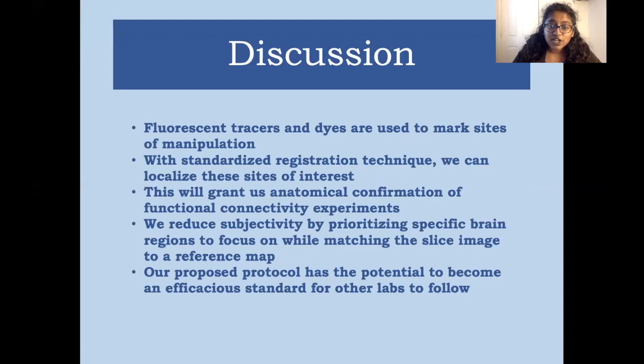We aim to reduce subjectivity by prioritizing specific brain regions to focus on while we're matching the slice images to a reference map. And we hope that our proposed protocol has the potential to become an efficacious standard for other labs to follow in the future.